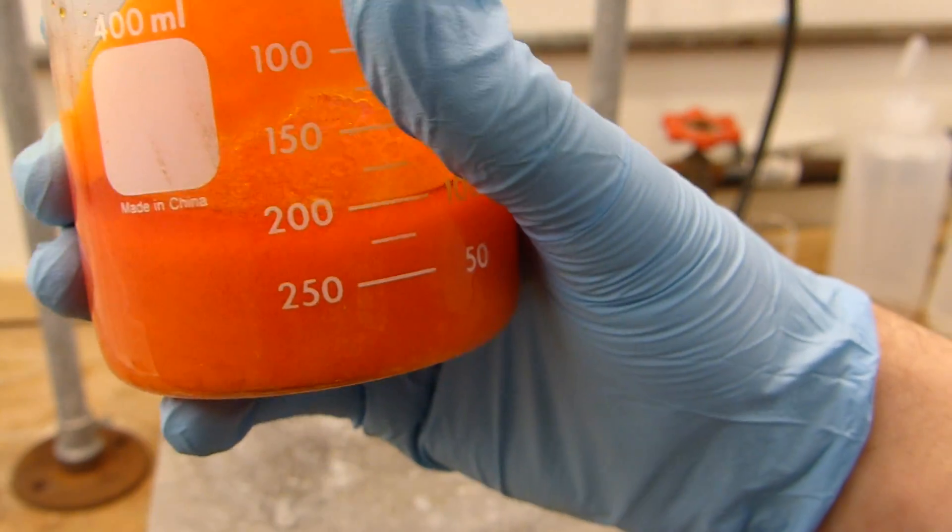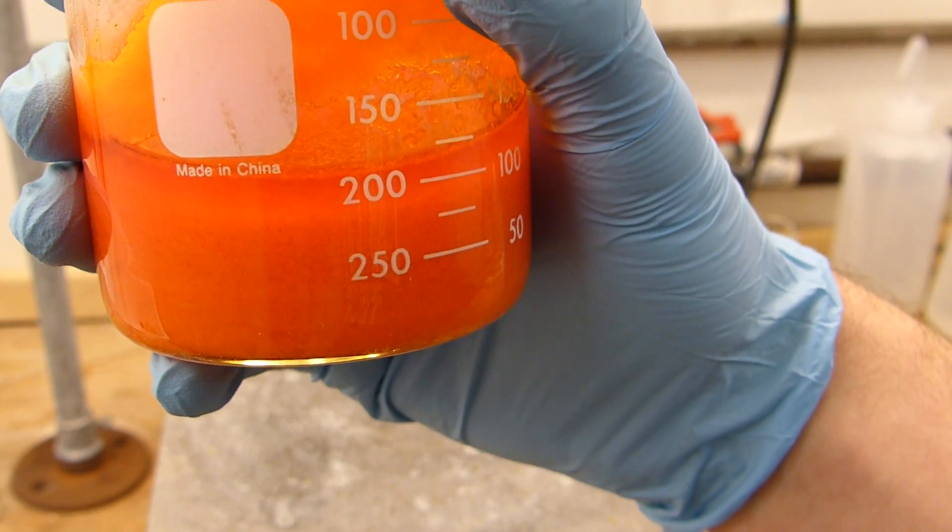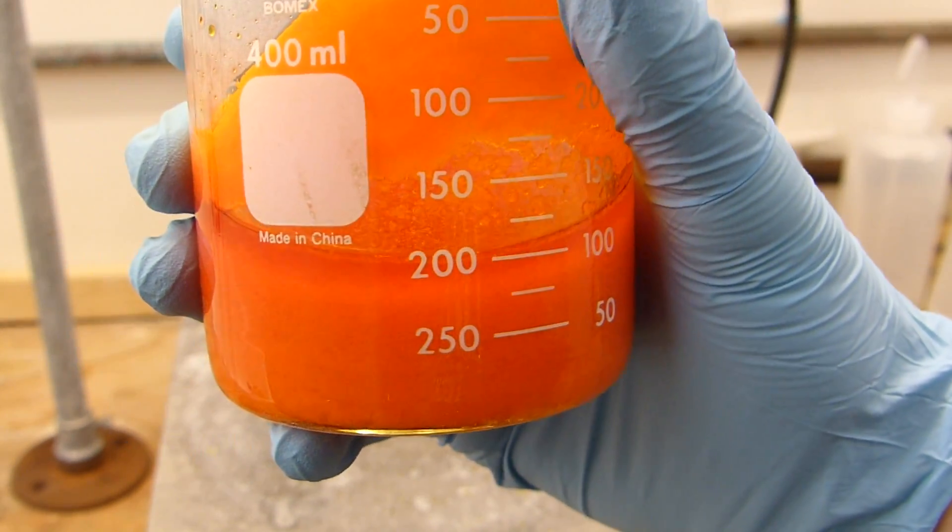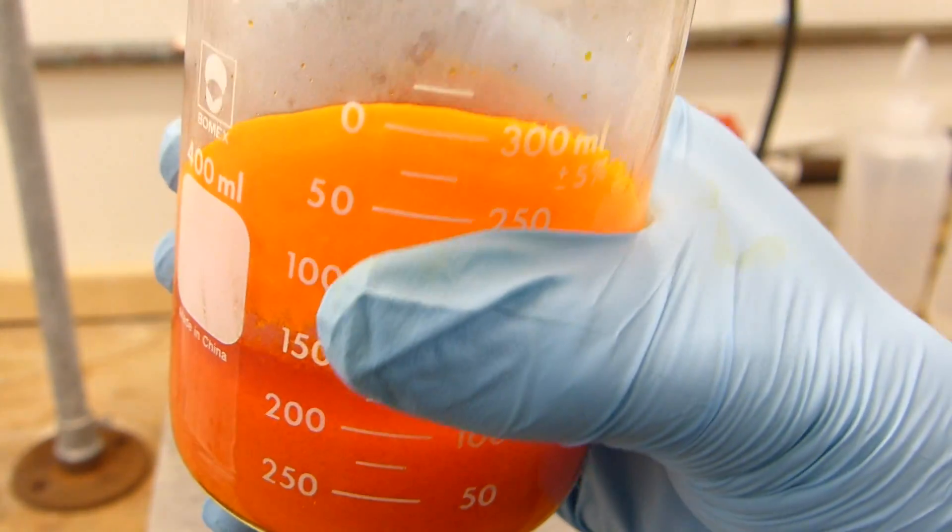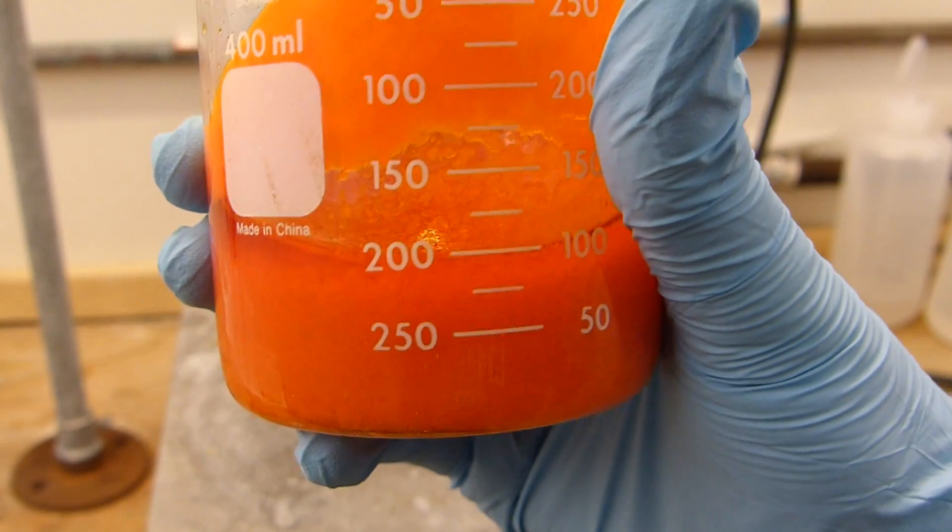So what's going to happen is I'll stick this in the fridge or the freezer for that matter to precipitate as much of the pyridinium chlorochromate as possible and then we can go ahead and filter off the product and then dry it.